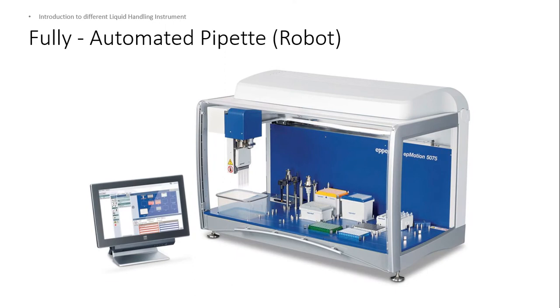So now we go to the fully automated pipette, which is commonly known as the robot pipette. This robot dispenses a selected quantity of reagent, samples or other liquid to a designated container. With this one, you can program the whole procedure on the monitor. Then it will do all the procedure. You can go for aspiration, dispensing. You can also do the mixing and everything as long as it is under the pipetting procedure.